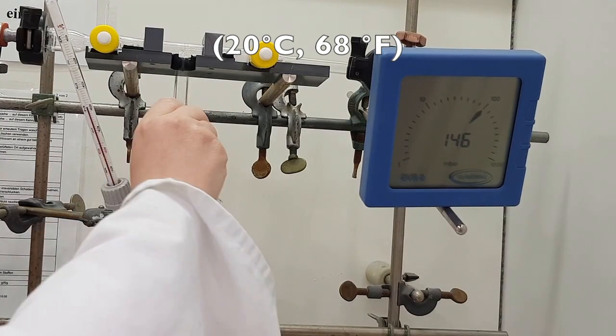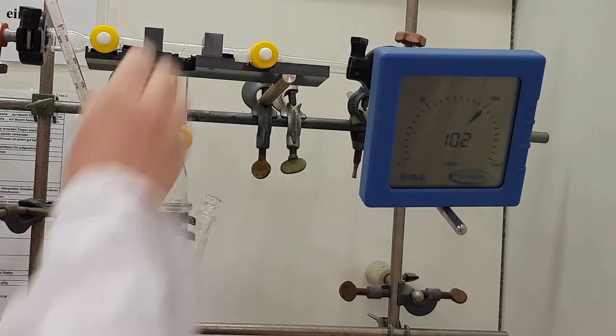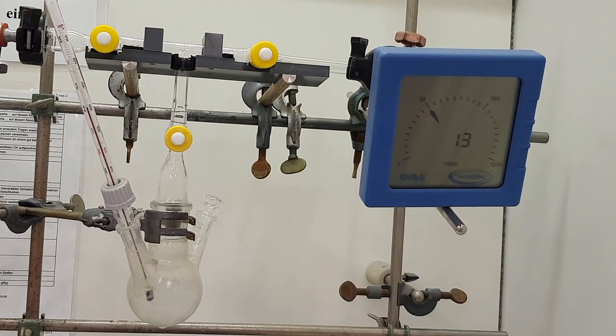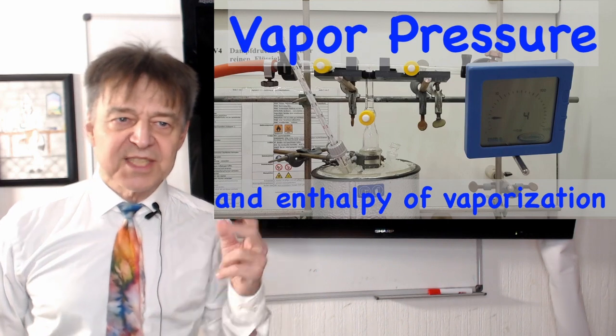Close stopcock 1 and turn the vacuum pump on. Open stopcock 3. When the manometer again reads approximately 0.7 kPa, stopcocks 3 and 2 are closed and the vacuum pump is switched off.